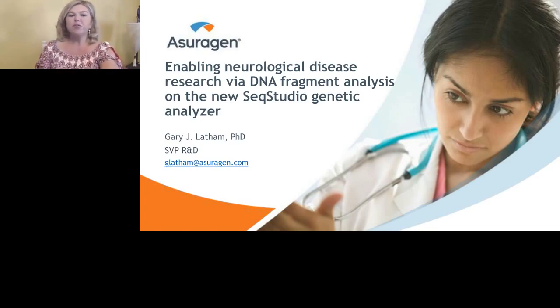Today we present the third topic in the series, enabling neurological disease research via DNA fragment analysis on the SeqStudio genetic analyzer, presented by Dr. Gary Latham, Senior Vice President, Research Development at Asuragen.